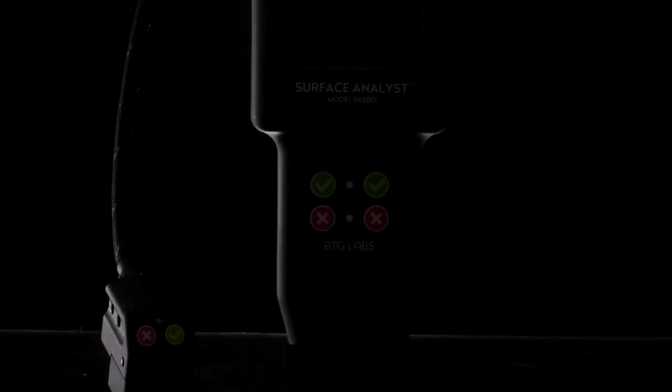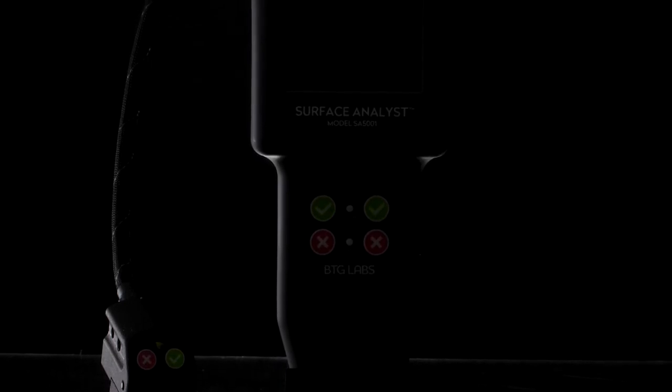BTG Labs' Surface Analyst 5001 is the first tool of its kind to allow manufacturers to make intelligent engineering decisions based on meaningful data to achieve zero defect manufacturing.